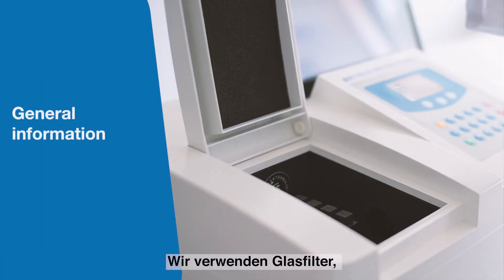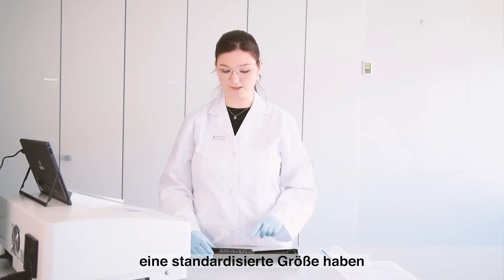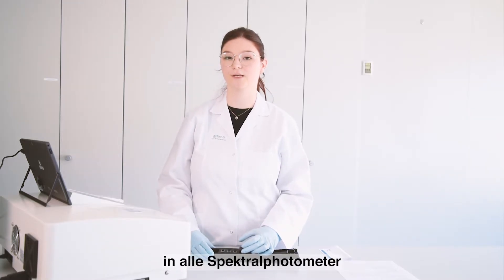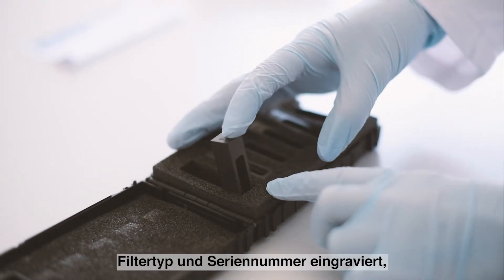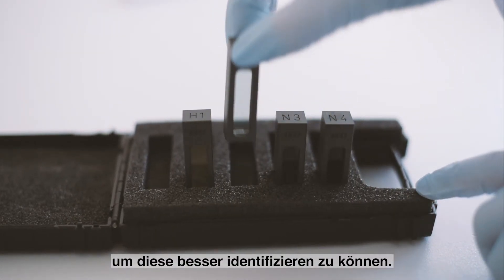We are using glass filters and they are a standardized size 10 x 10 mm, so they are designed to fit into all spectrophotometers. The frame is engraved with a filter type and a serial number for identification purposes.